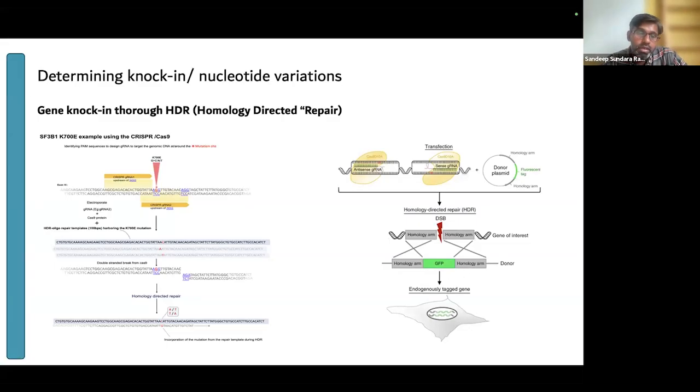So this has been quite useful for generation of different cell lines, and the way you would do this is that you would be looking into homology directed repair and pushing cells to use this mechanism as compared to the more efficient NHEJ repair mechanism. Now, pushing cells comes at a cost because cells do not want to do this. They want to go to the easy path where they repair this double strand break quite readily by just inserting and deleting some of the bases. Therefore, finding your insert is sometimes a bit harder, and you would need to do a thorough QC.